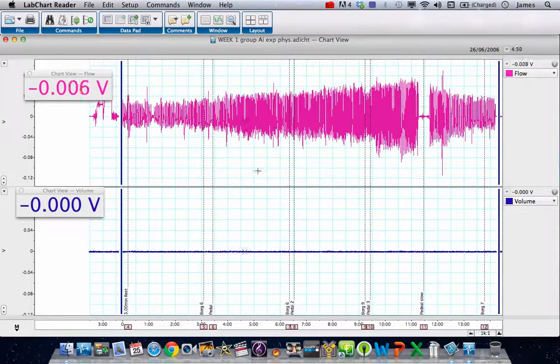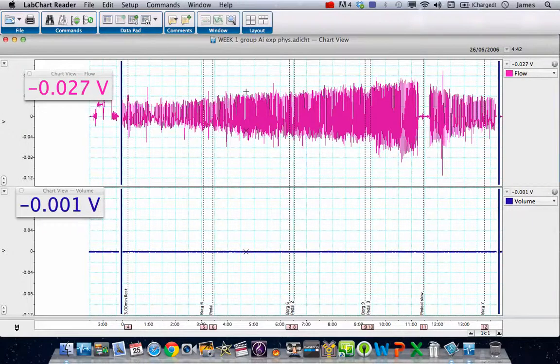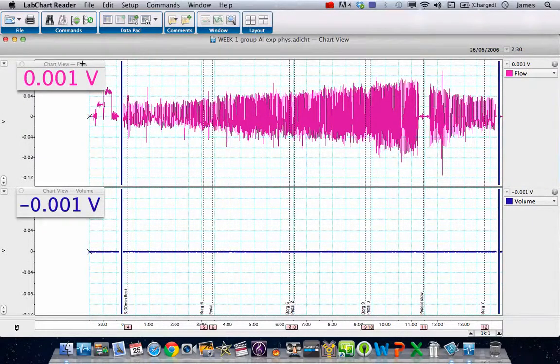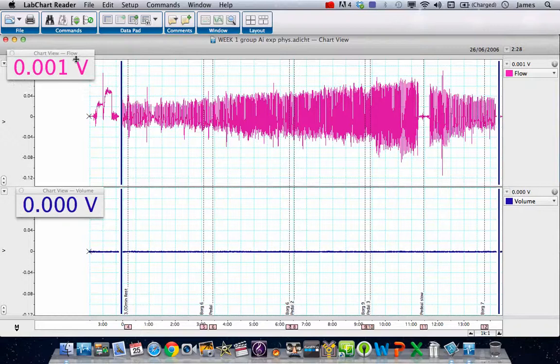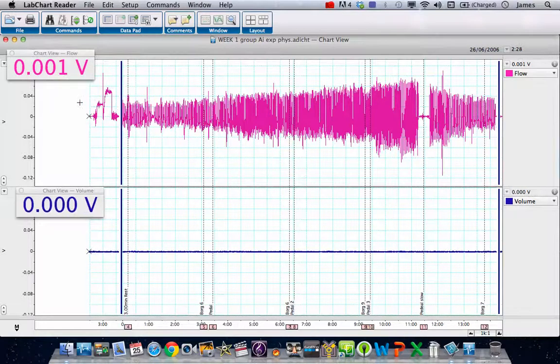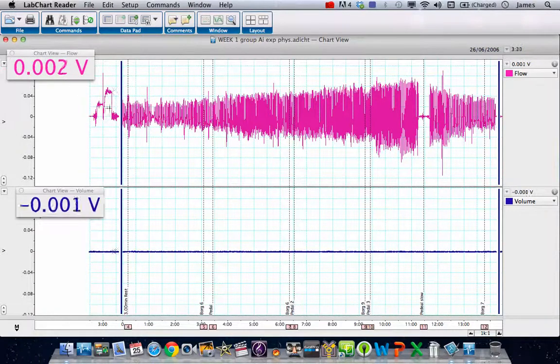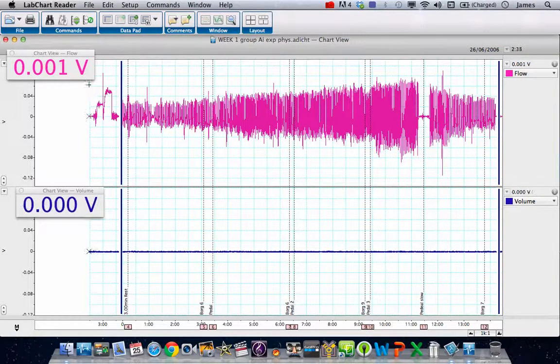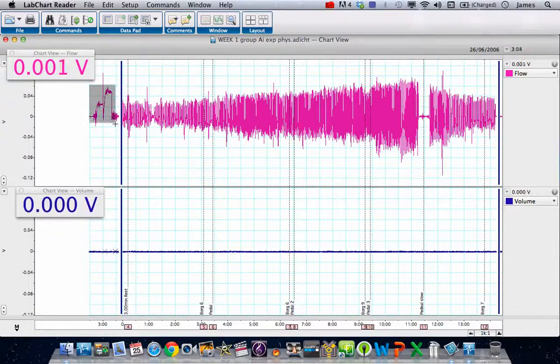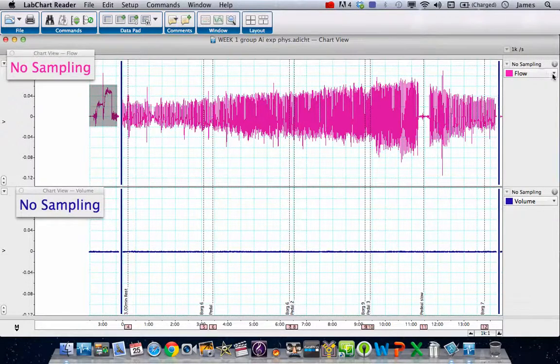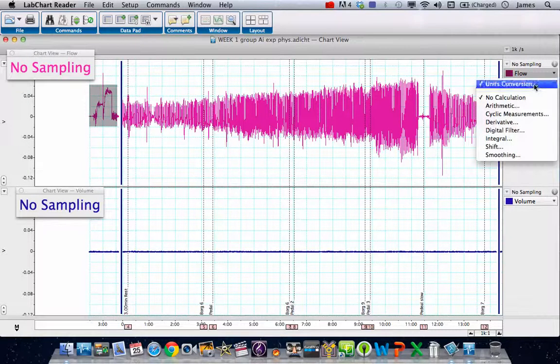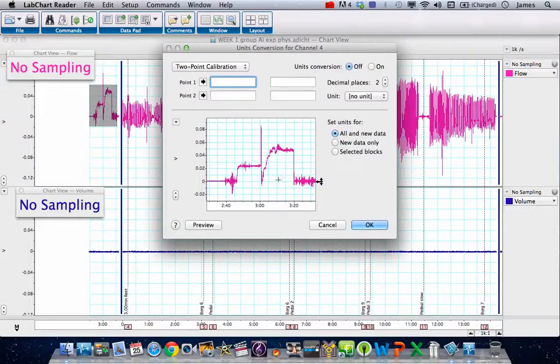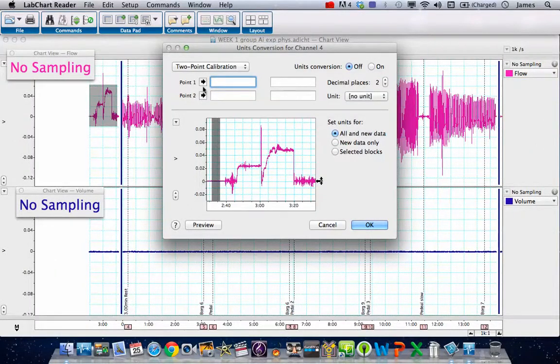The first thing we need to do is make sure that the pink data, the flow data, are calibrated properly. Because we did this experiment properly, we've got some calibration data here of one and two liters per second. I'm going to highlight those flow data, click on the drop-down list over here, and choose unit conversion.